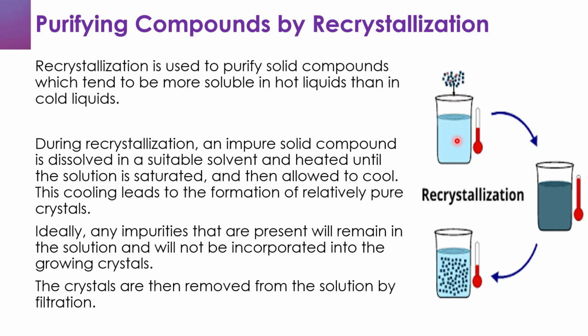So this is our suitable solvent, and heated until the solution is saturated. As you can see over here, this is indicated by the rise in temperature over here, and then allowed to cool.